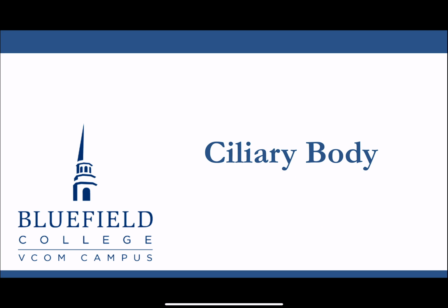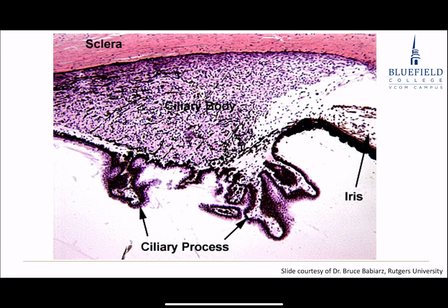All right, let's take a look at the ciliary body. Here's my ciliary body right here, which means the sclera would be up here. Down in here would be aqueous humor of the posterior chamber. Here are my ciliary processes coming off, and once again, I don't always see them running their full length. I see little tiny pieces, right just below between the R and the O down here. There's a little bit of a ligament of Zinn. I see little pieces of it up here as well. I can make out a pigmented layer and then a superficial non-pigmented layer of epithelium.